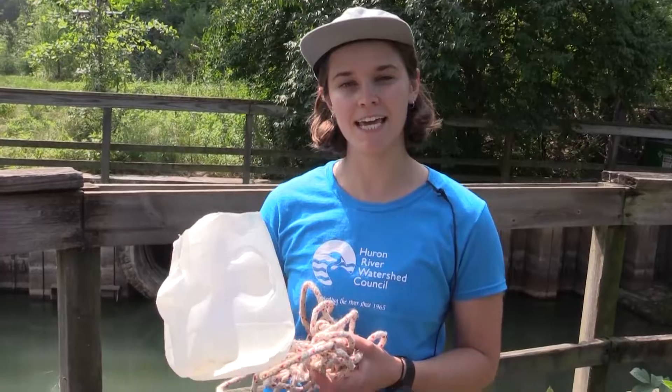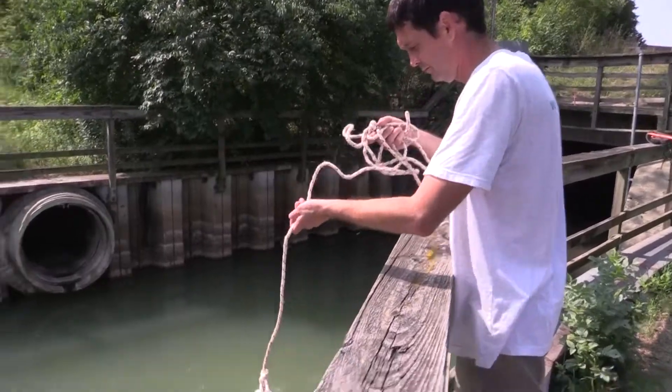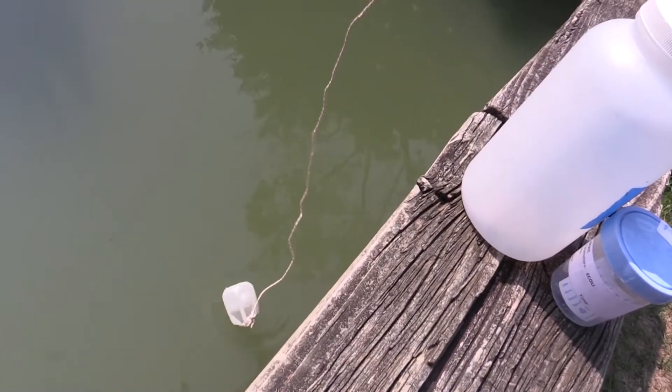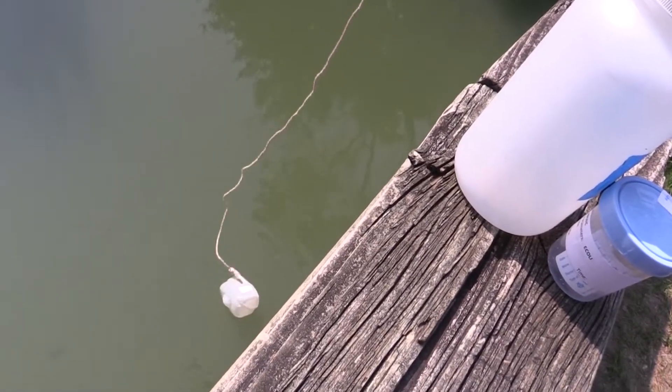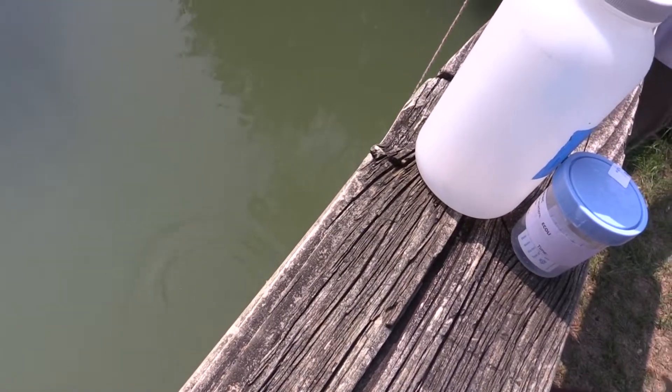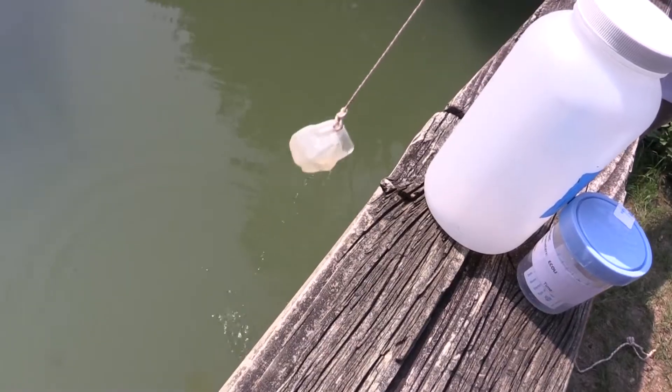If you are unable to take grab samples at your sampling location, use the bucket sampler to take samples off of a bridge or levee. Similar to taking a grab sample, we must rinse out the sample bottle three times. Only when taking a bucket sample, also rinse out the bucket sampler three times before rinsing out bottles and prior to sample collection.